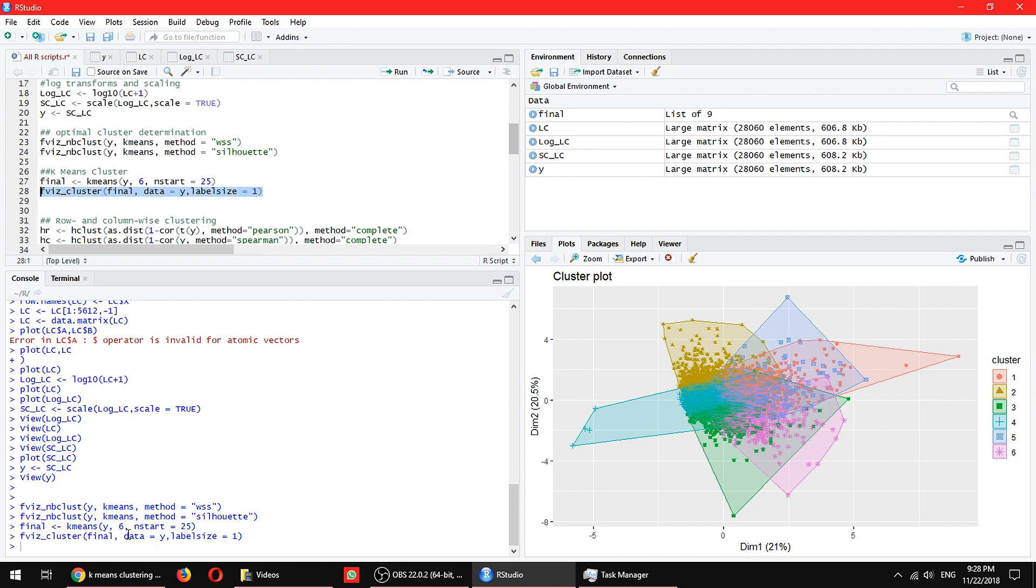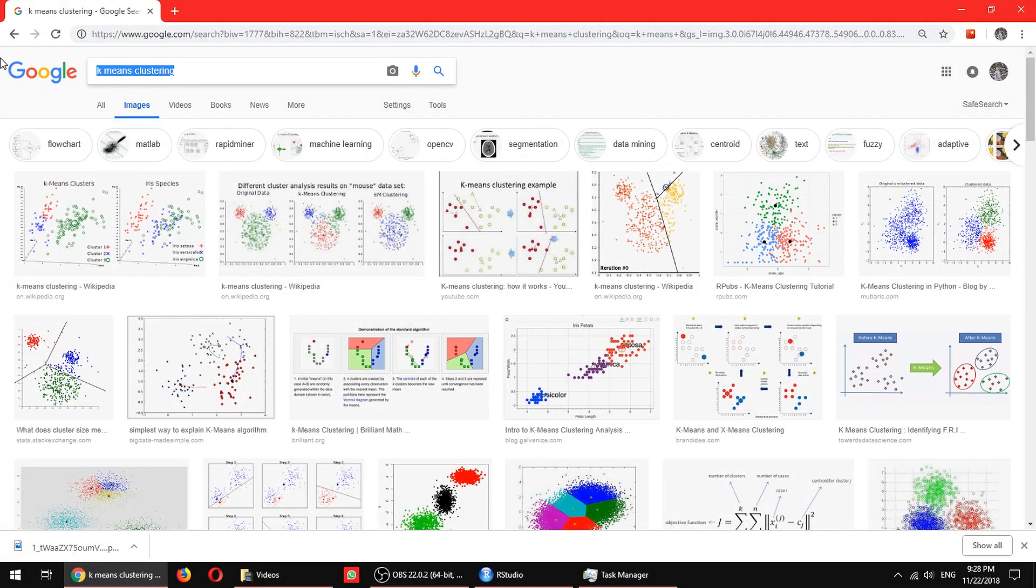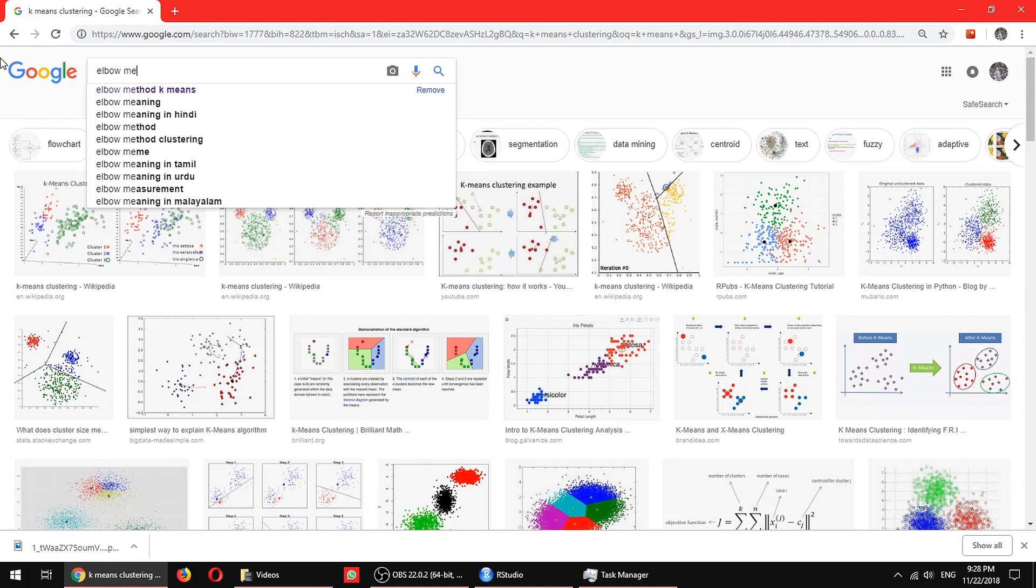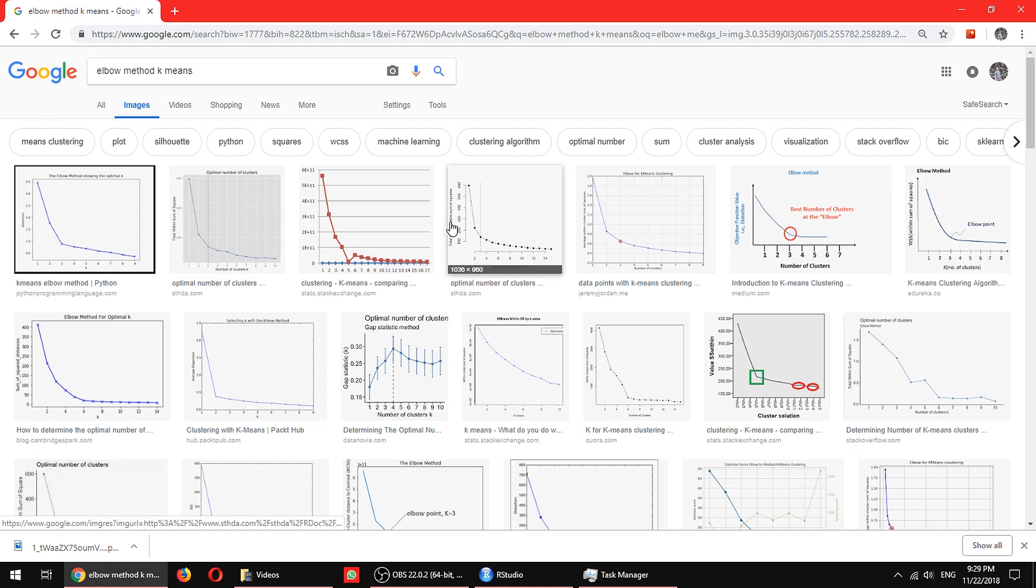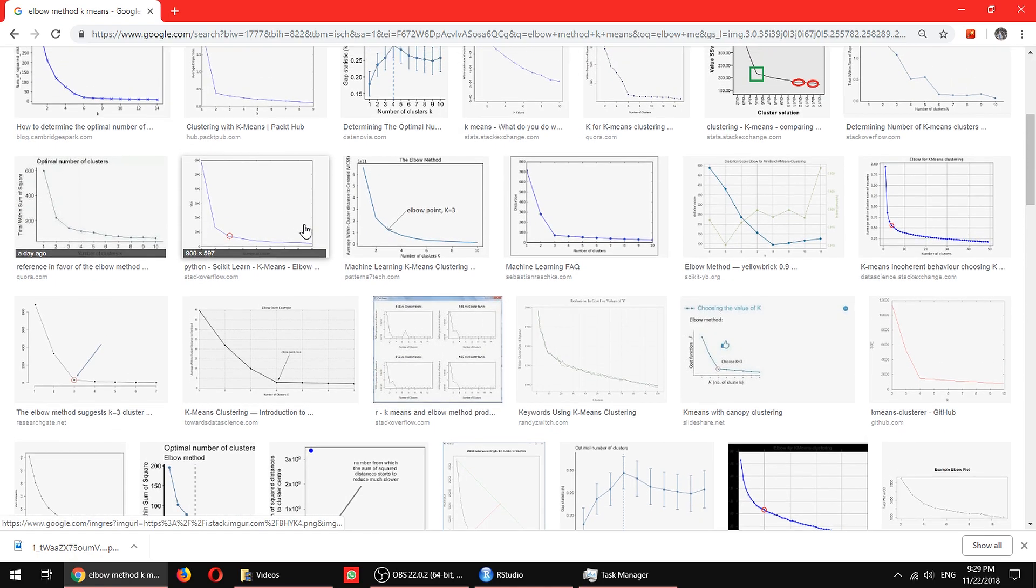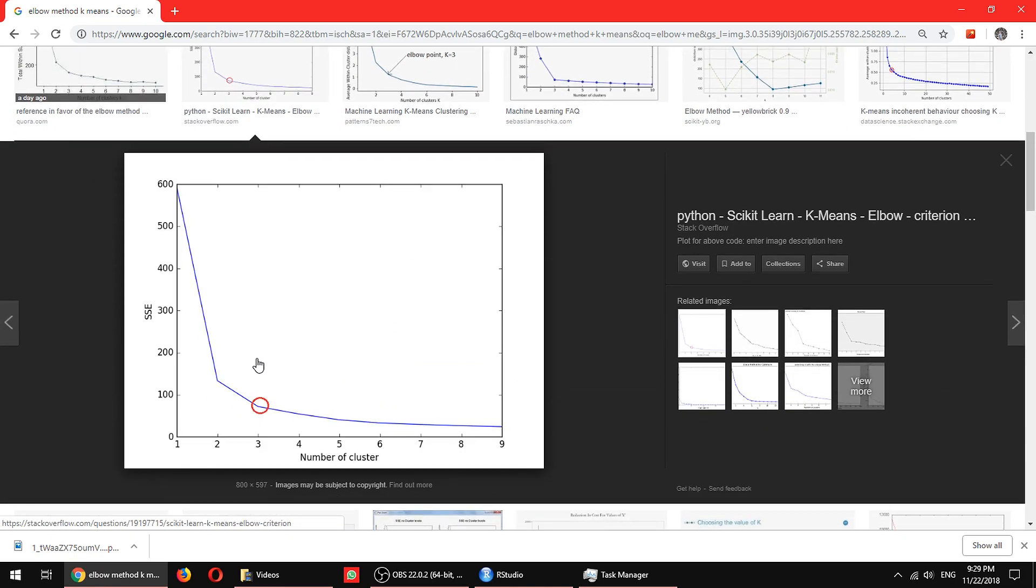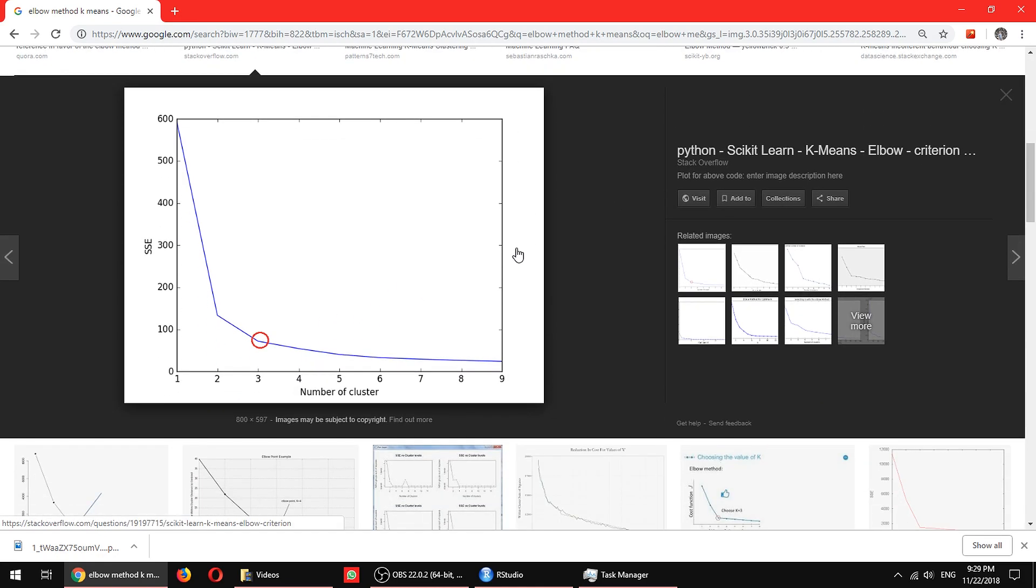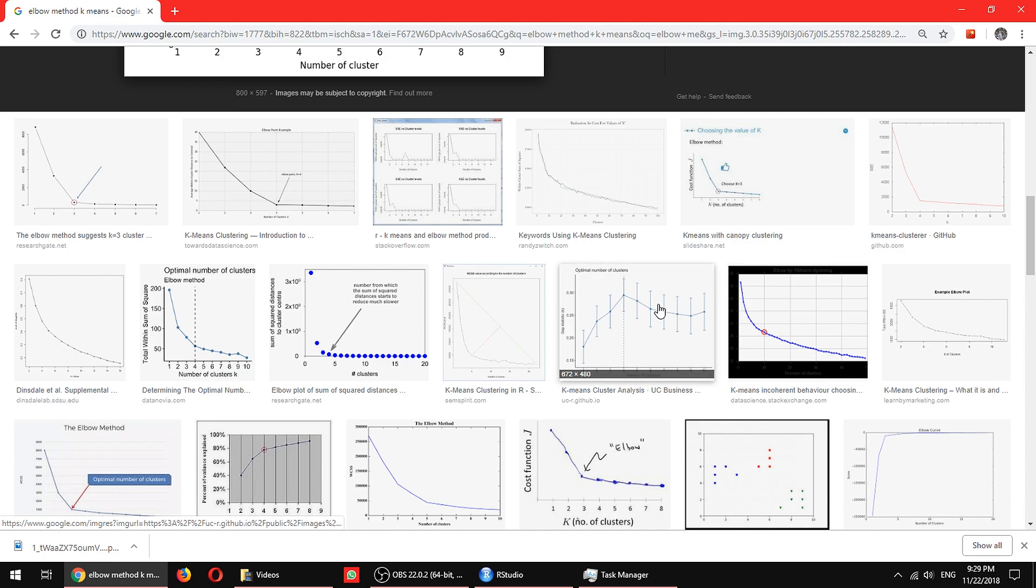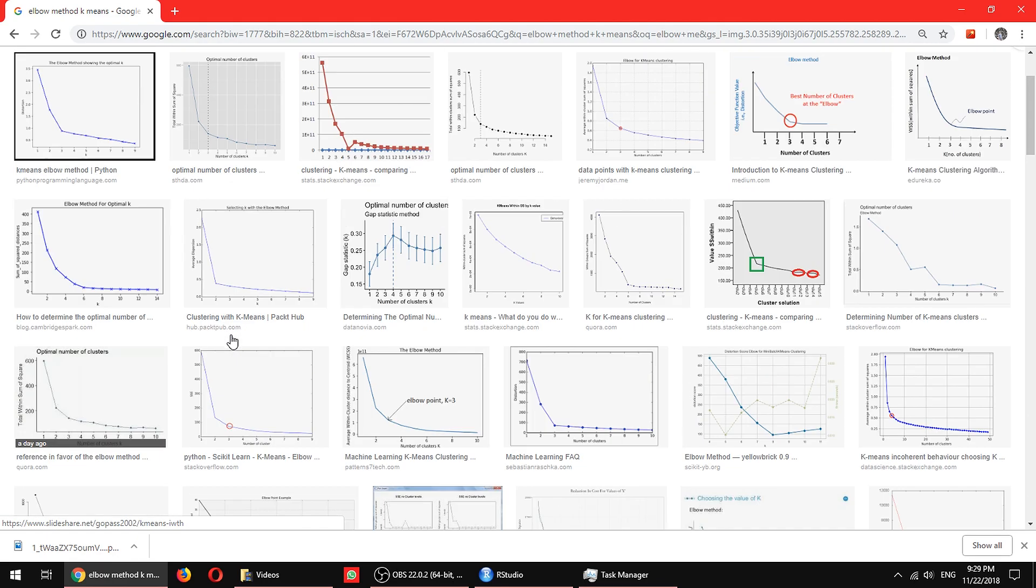Just a short summary. We have actually talked through what is the elbow method. So the elbow method k-means determines how many best clusters there is based on the sum of square distance. We look at the elbow. So a sudden change of the gradient of the graph when you are plotting it. And we will look at the output and all that thing. You can see there's a good button, a good emoji.